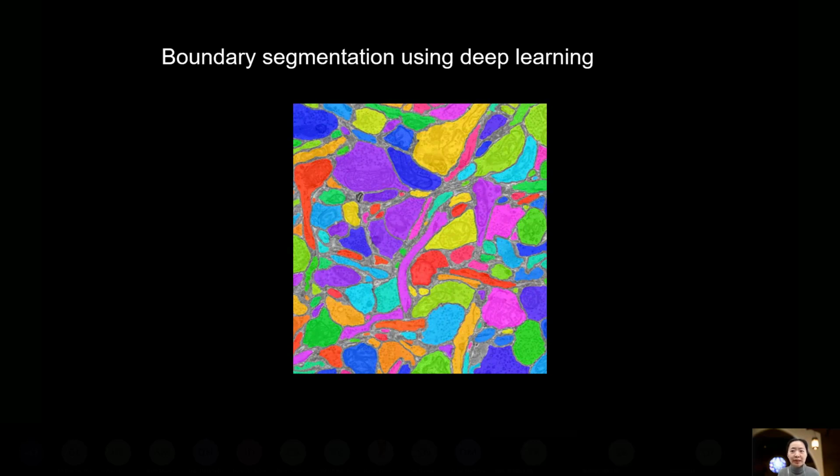We are also testing the trained models on subsets to scale up to larger volumes of the data sets. And we are trying to apply transfer learning, to use the trained deep learning model to segment other data sets than the one we used to train the model.